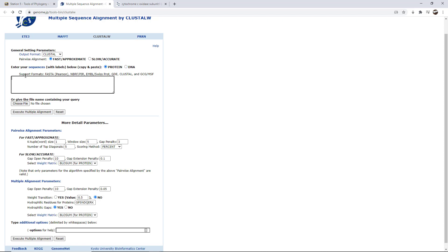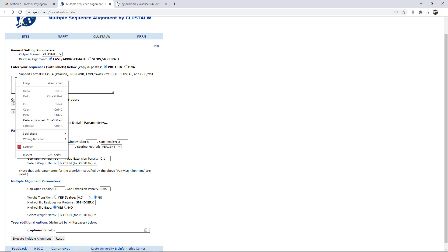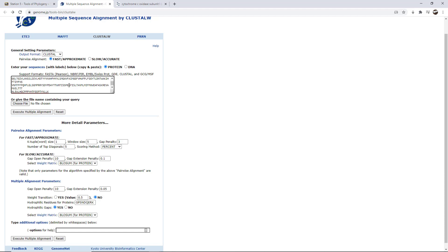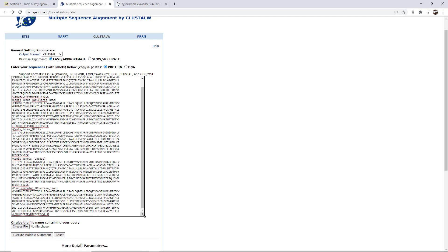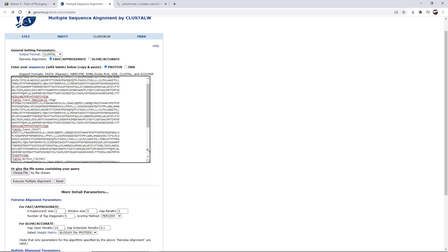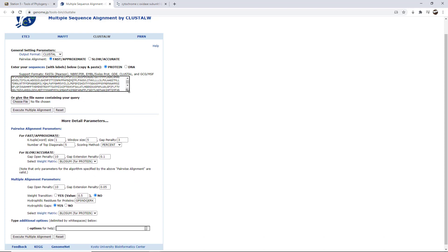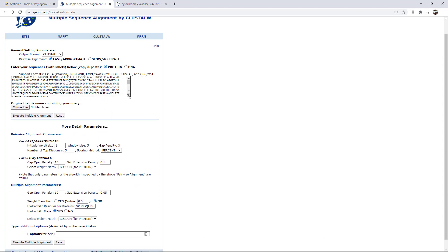And I'm going to simply paste into this box my information. So I can either use the paste option here or I can use control V, but it simply pasted the information that I copied from my notepad. Okay. Well, simple enough.